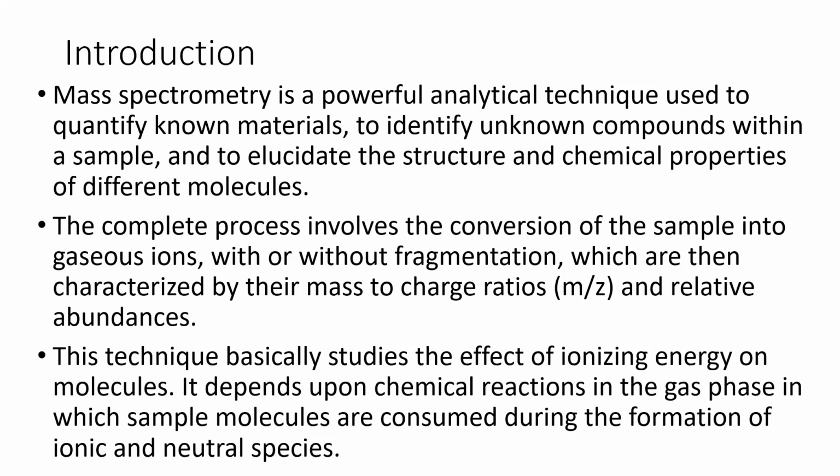The complete process involves the conversion of a sample into gaseous ions. The sample or your molecule is first converted into gaseous ions with or without fragmentation. Then later on, fragmentation occurs, and the fragment ions and the molecular ions are characterized by their mass to charge ratios and their relative abundances.